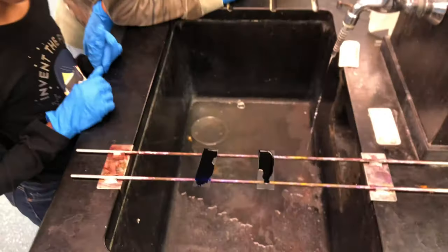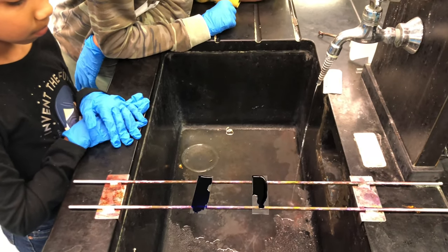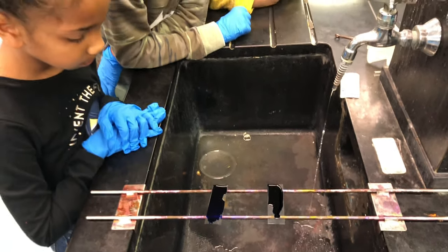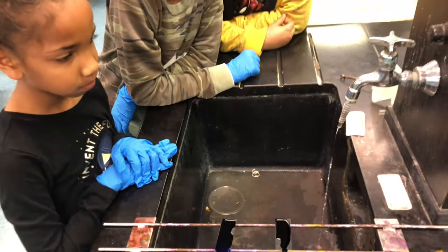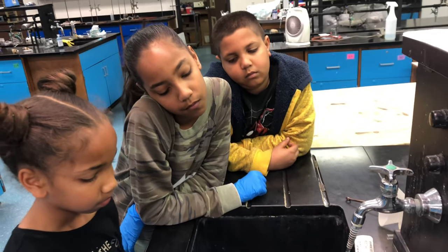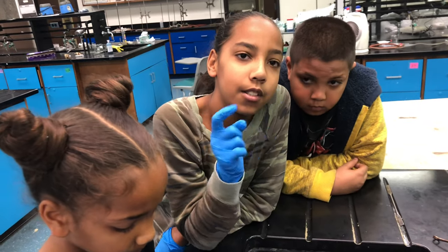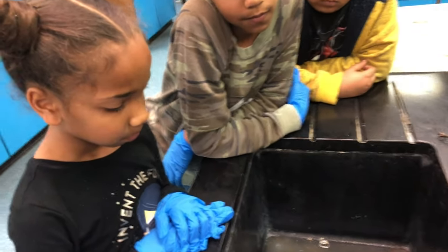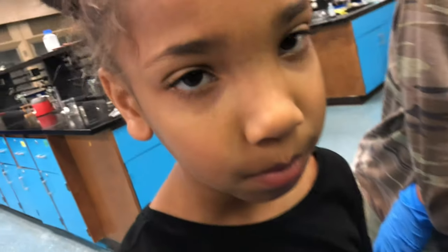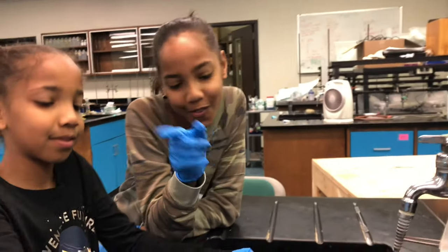We are going to keep the stain on for about 30 seconds to a minute — 30 seconds is good enough. We're using methylene blue. If it's staph, what's it going to look like? It's going to be in clumps like grapes — circular clusters.